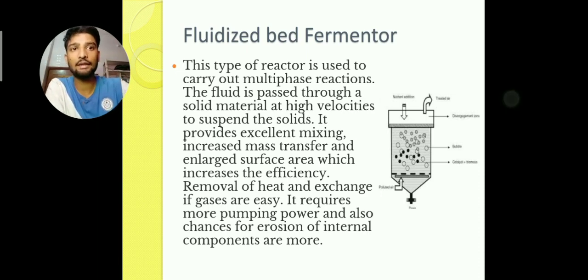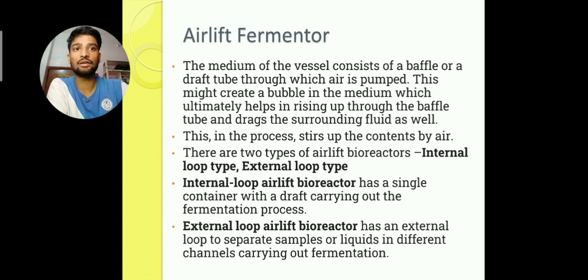The last type is the airlift fermenter. The vessel consists of a baffle or a draft tube through which air is pumped. This creates bubbles in the medium, which rise up through the draft tube and drag the surrounding fluid as well. Thus, in this process, the contents are stirred by air.